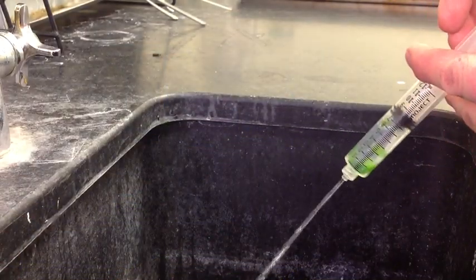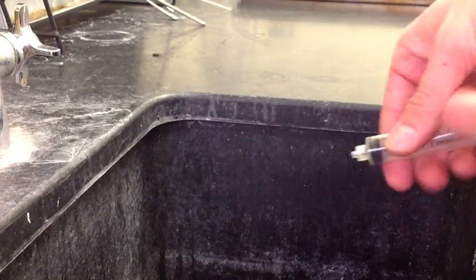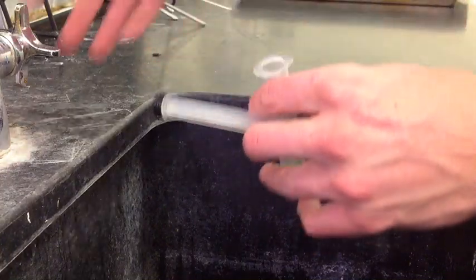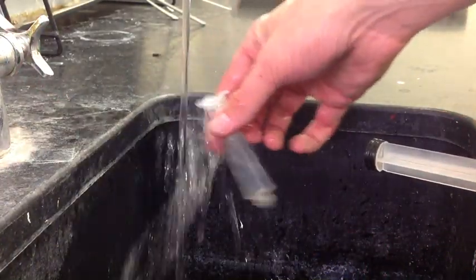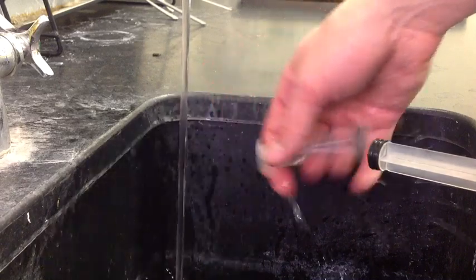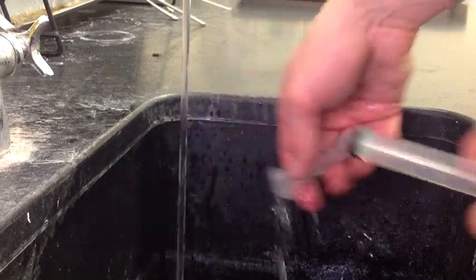When your experiment is concluded, simply rinse the entire thing down the drain and rinse out your syringes well.